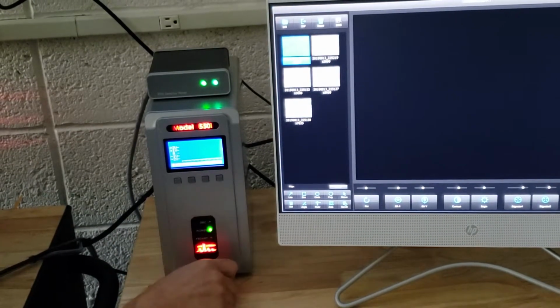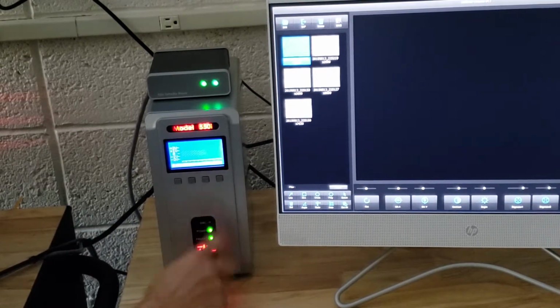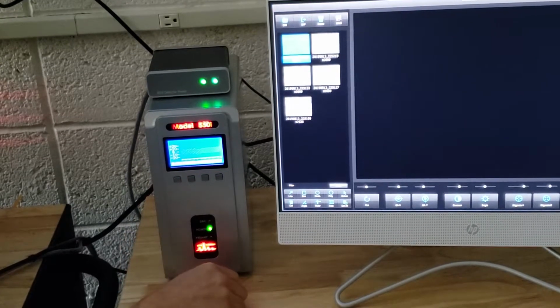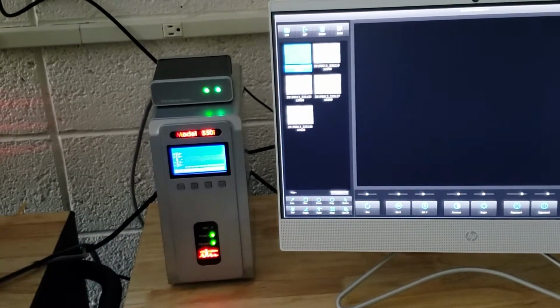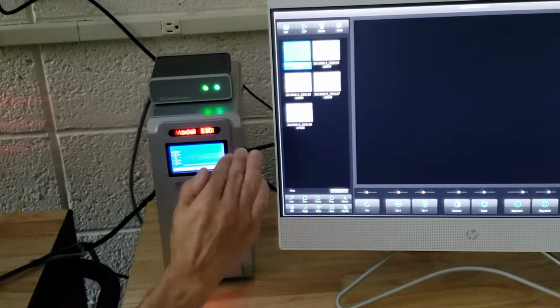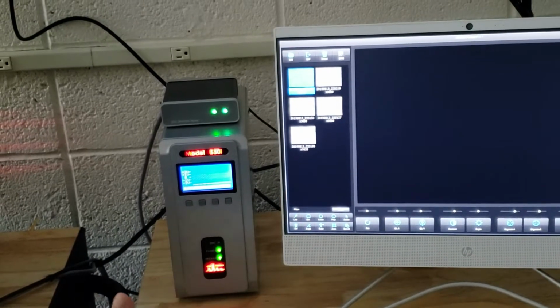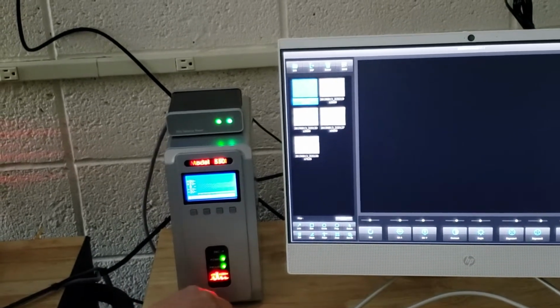I can go enter detector and I can go start. As long as I have a beam on, it'll start ramping. And even if I don't have a beam on, it's actually ramping right now. It tells me that we have an input ramp on our analyzer, which is positive. If that was a steady DC level, that would be not positive. So this is just some troubleshooting stuff for me, realistically, that IXRF has put in it, which is really nice.